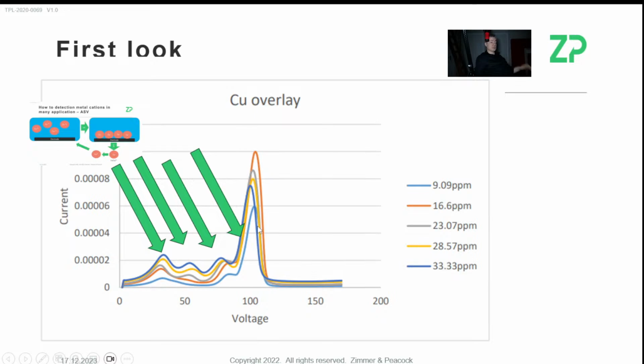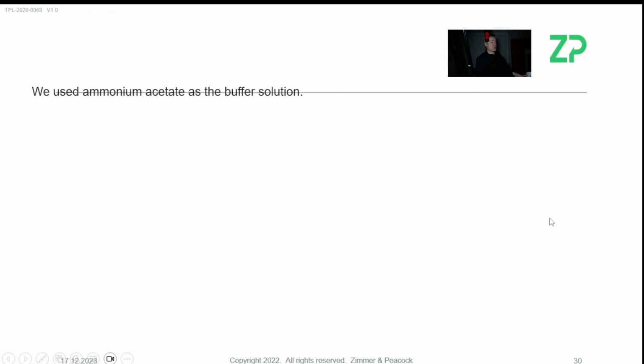So by the time you get to looking for a relationship in oxidation 4, where you said, right, well, that peak should be proportional to the original concentration, the simple relationship's not there because you've had at least 3 oxidations on the way to get to that 4th oxidation. Question is, why is it happening?